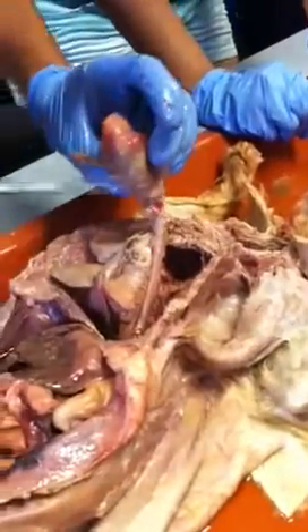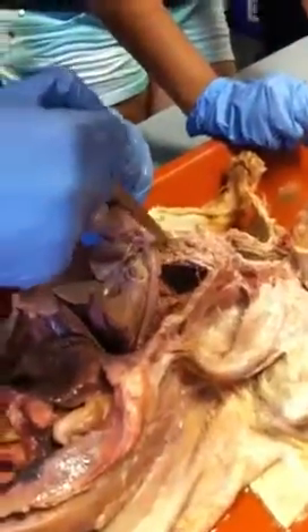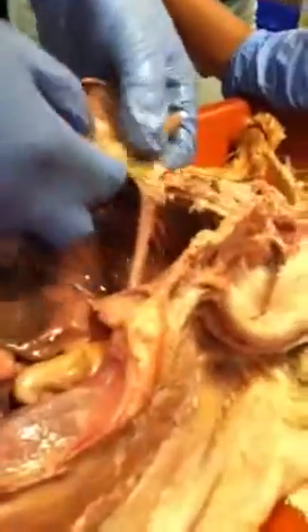As you can see, this is going to be the aorta extending out of the heart down to the rest of the body and upwards at the same time to the head and to the lungs. Now let's cut the aorta — so there's the heart, and then we're left with the lungs and the trachea extending down from the head into the lungs, into the branching lobes here.